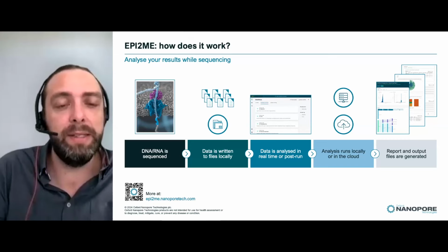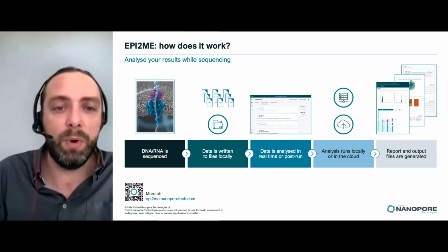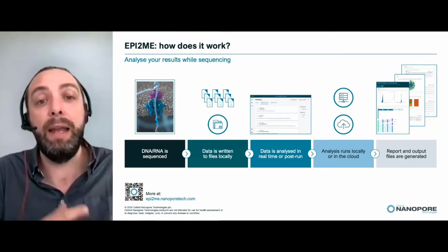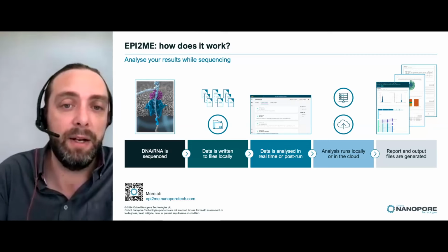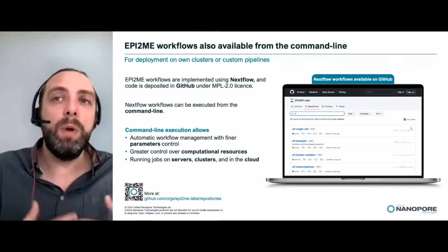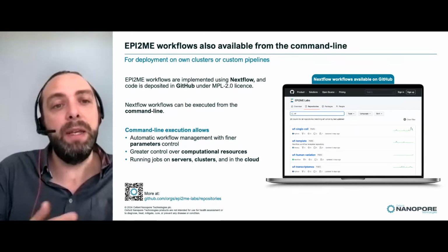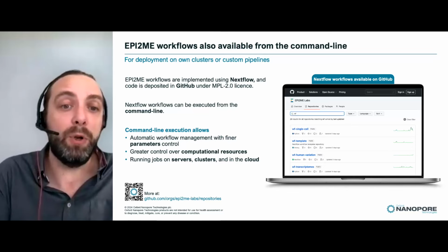So if you've completed sequencing and completed base calling and you want to analyze data, again, these workflows can obviously be used to analyze any data that sits on a hard drive it can access. But like I said, what we want to do is facilitate the deployment of Epi2me and our workflows within a production environment.